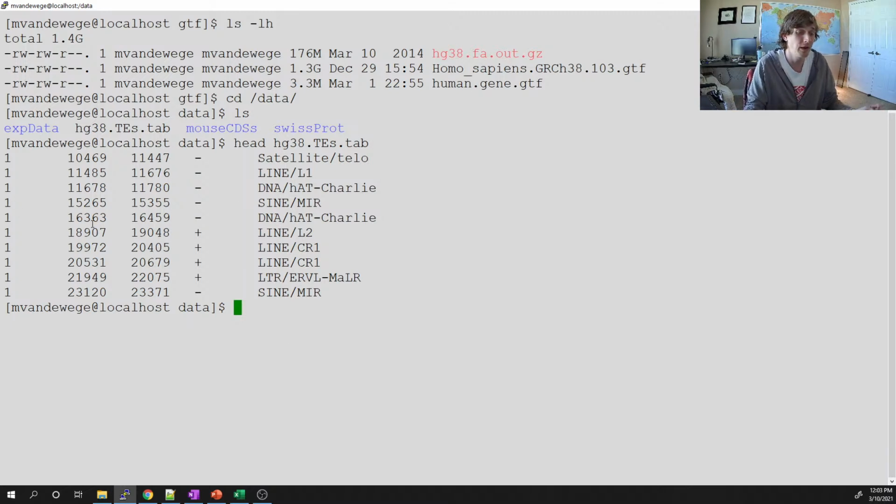And GTFs are similar to a bed file because the first three columns will be the same, just the chromosome number, the start position, and the stop position. Right? Always going to be the same in a bed, GTF, GFF, or usually a VCF as well. Always relevant. But no, so you can copy this over to your home and play around with it and follow along with what I'm going to be doing. Again, just learning by doing. Like what's in the genome, learn by doing.